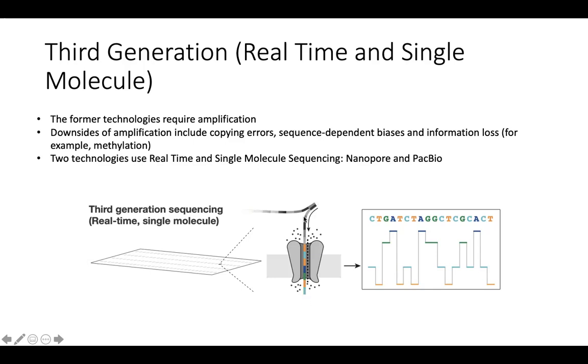I am not entirely sure if we are talking about 100,000 base pair long reads, but these technologies are also called long reads because they have the ability to produce long sequences, or the algorithms that are used to deconvolute the signal that comes from the trespassing of the base pairs through the pore.